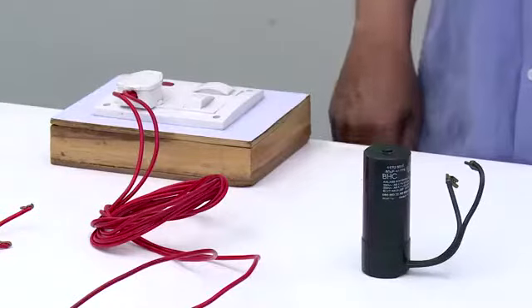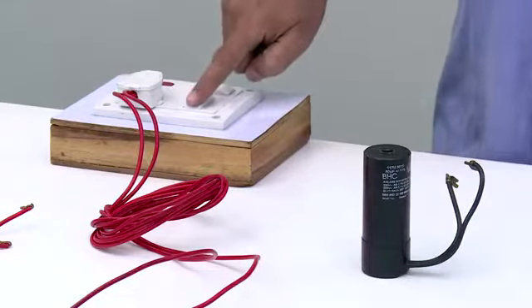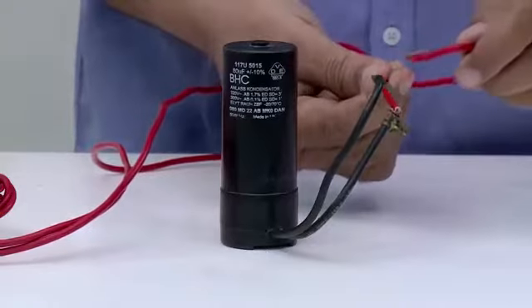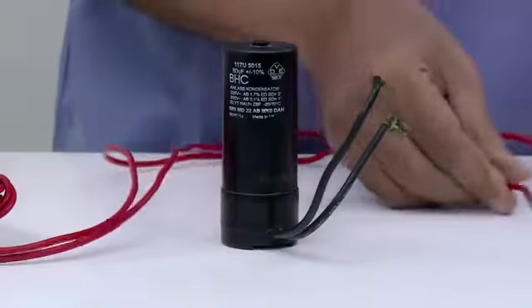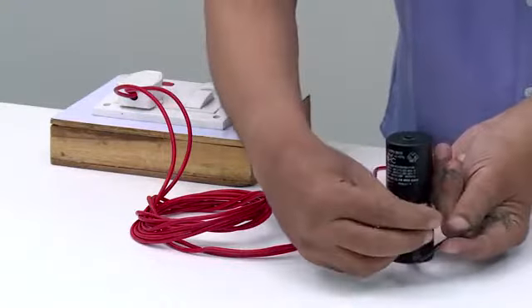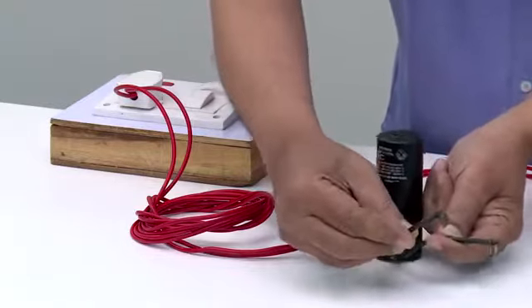Let's test the capacitor by applying rated mains voltage to it for a few seconds, and then short circuiting the leads. If spark appears, the capacitor is in order.